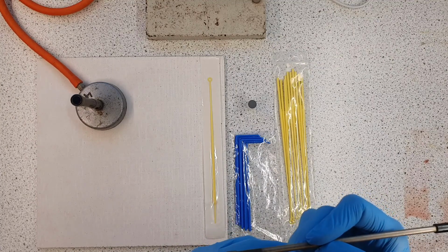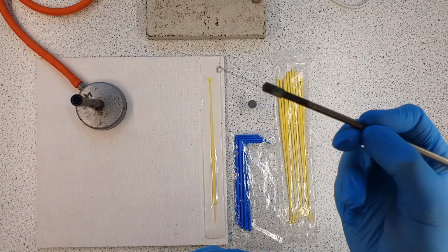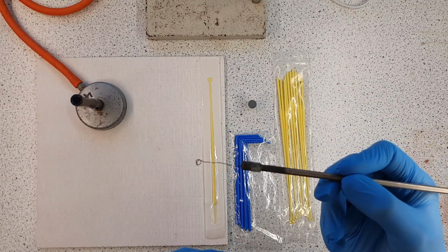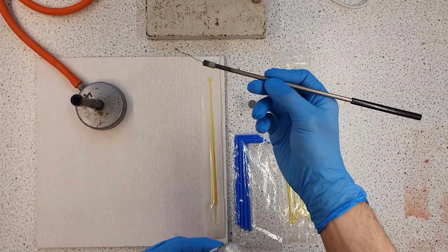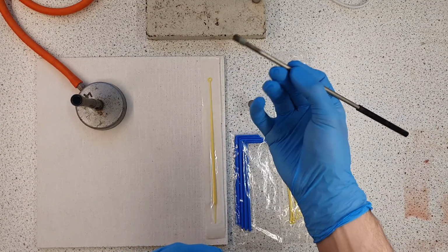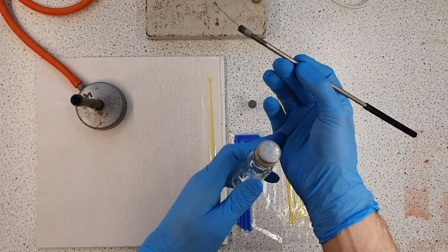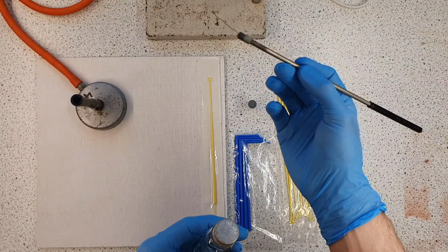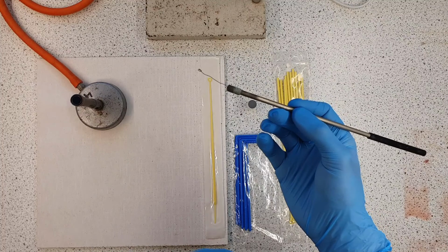So, to comply with that standard, we're going to hold any equipment we're using. In this case I'm using the metal loop just because it's the first thing I've got on hand. We're going to be holding it like we would a pen, or like most people would a pen. I'm sure there are some of you who would hold it in a different way. So holding it as we would a pen, and we're going to be using our little finger in combination with the surface of our palm as a grasping surface. And again, if you're left-handed, obviously you can accommodate and just swap things around.